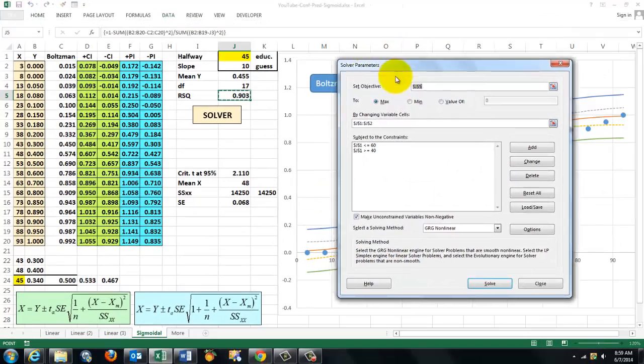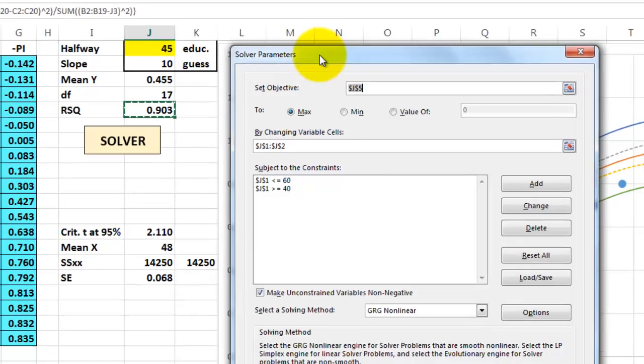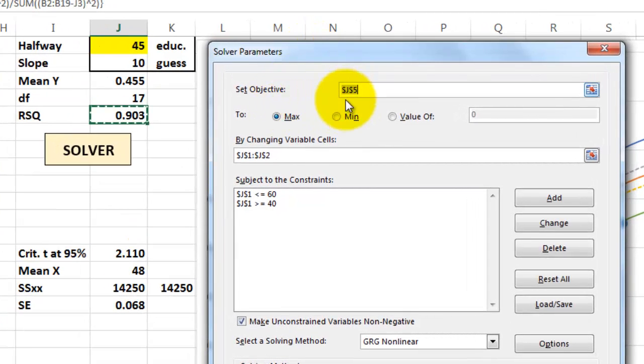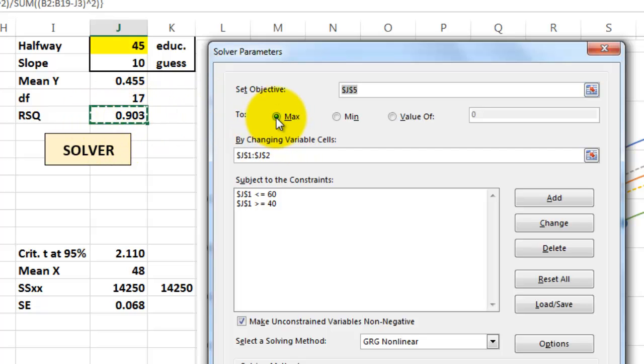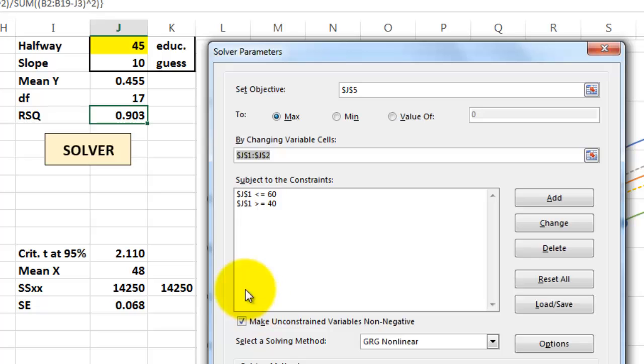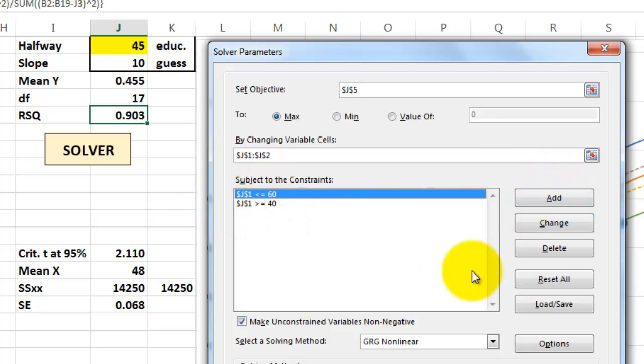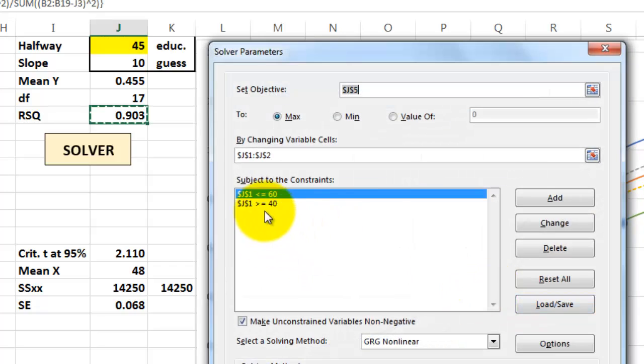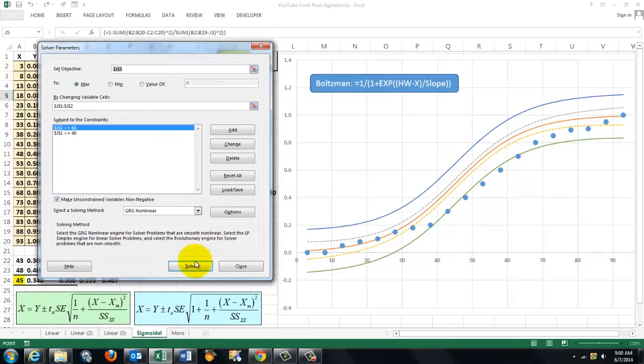In solver you have to set a few things. The first thing you need to set is what is your objective. That r squared is as high as possible, max. By changing the two parameter values that I guessed on my own. We have to add two constraints. The first one is that the halfway value should be less than 60, the second one should be more than 40. And then I'm going to solve everything.